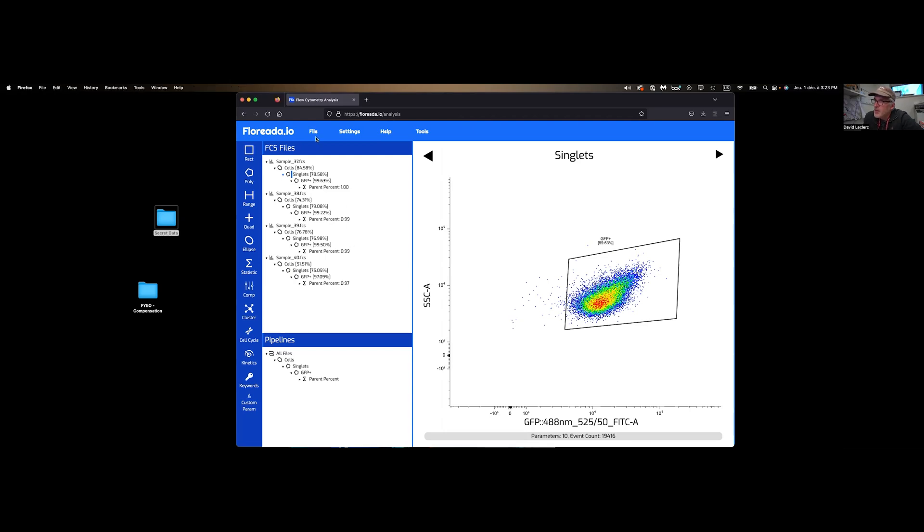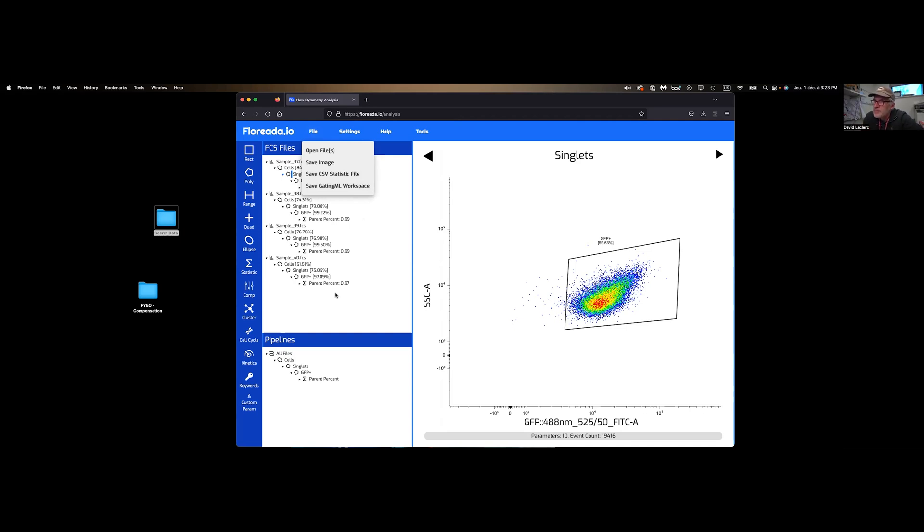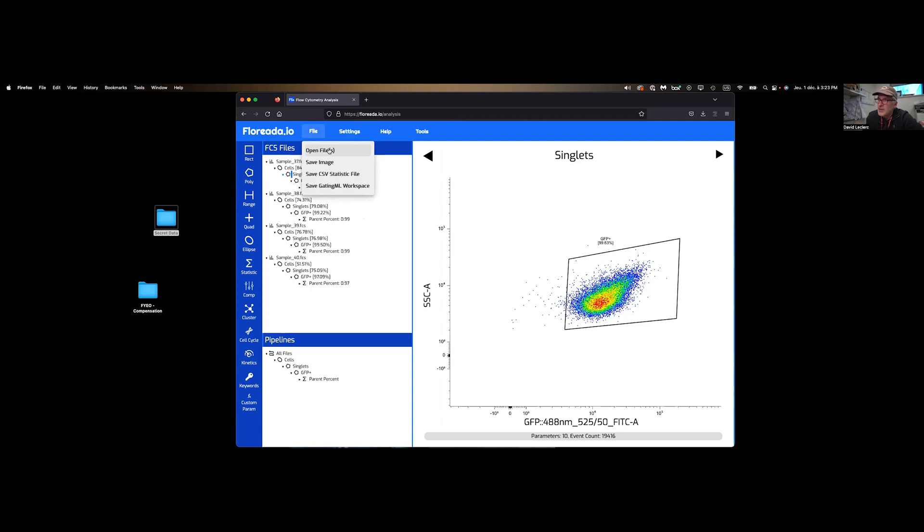Finally, you can export the workspace. And so that's essentially your set of gates that we've made so far. So if this is an experiment that you're going to be repeating over and over again, you don't want to gate all the time. You can simply save this gating workspace. And to open it again, you're simply going to open file and open this XML file that you will just save. This is simply a simple experiment here, just screening for GFP.